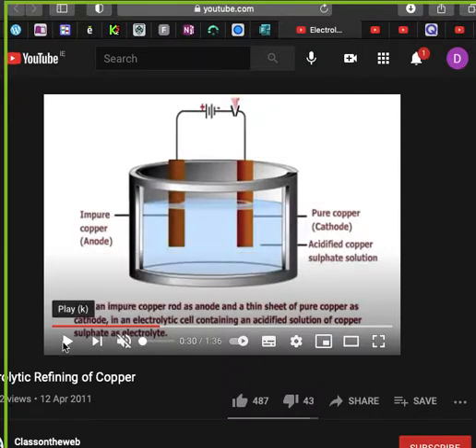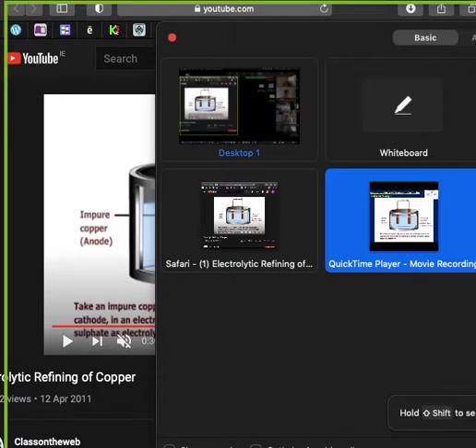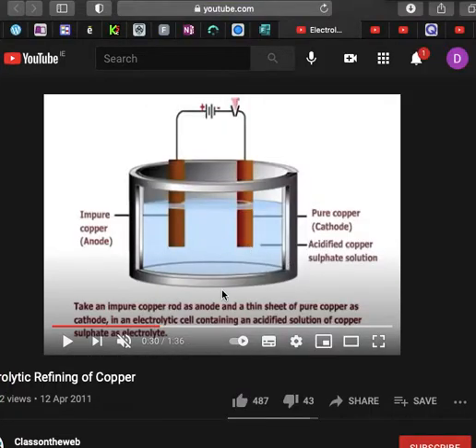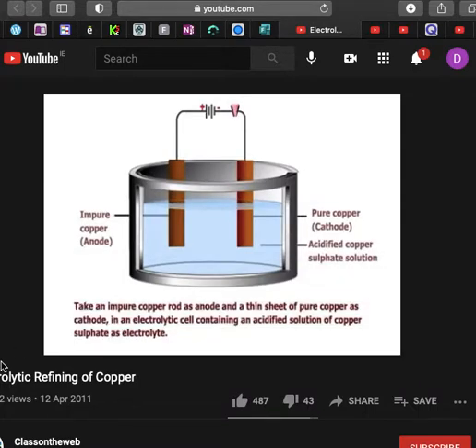So this would be the setup if we were to do the electrolysis of copper sulfate with copper electrodes. Here I have to change my screen, don't I? Yes, I do. So in reality, the bright blue liquid is what we would see. And we now have our copper anode and cathode, which are going to be active. They're actually going to take part in the electrolysis. You can read along the bottom if you wish, but I'm more interested in you looking at what is happening inside the vessel.